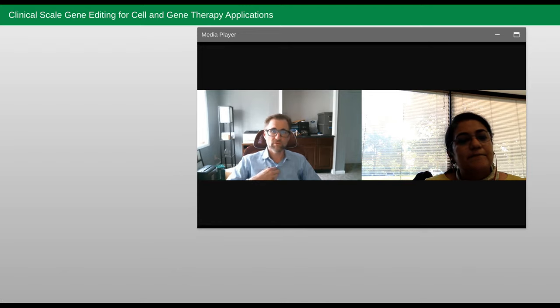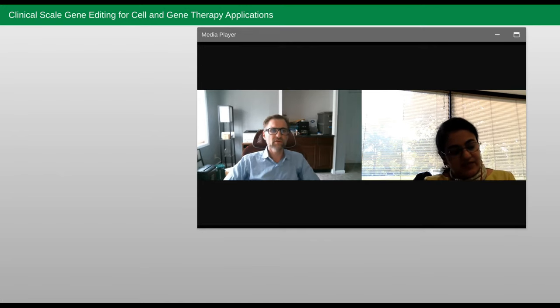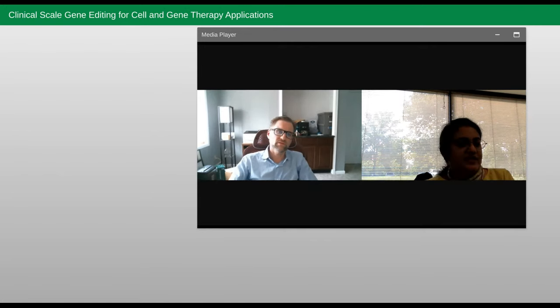Let me go ahead and ask one from my own end, just listening to your talk. I noticed in one of the case studies, I think it was one with a collaborator at UCLA, you had a pretty robust HDR integration. I think it was like 26% or so. What do you think, where do you see the field at this point? Because I know that's something people are looking to improve those numbers. Why did you get such a high integration, and how have you seen your collaborators improve HDR integration?